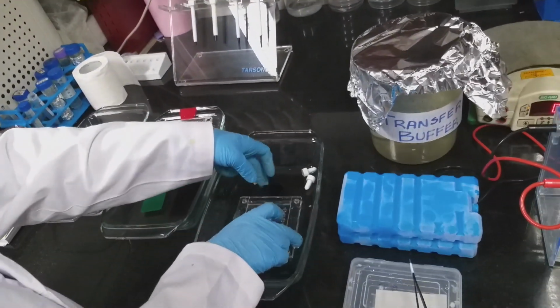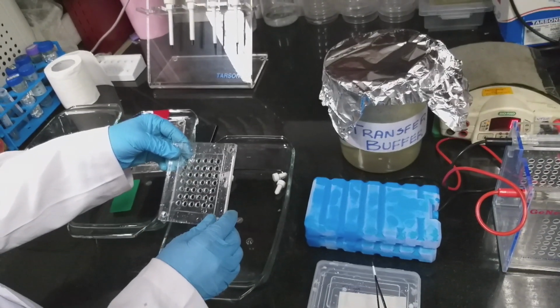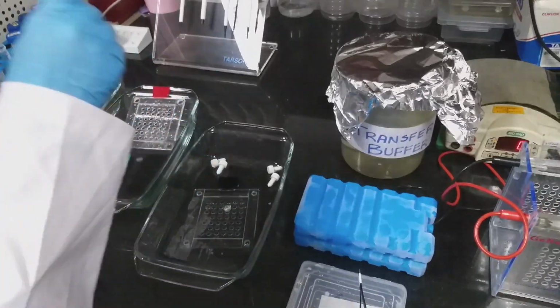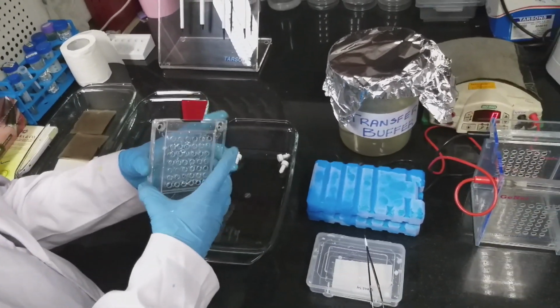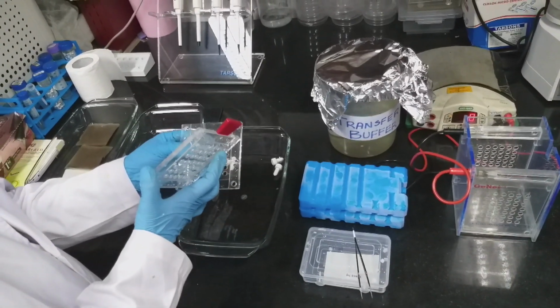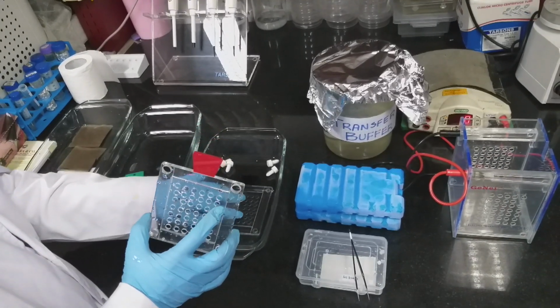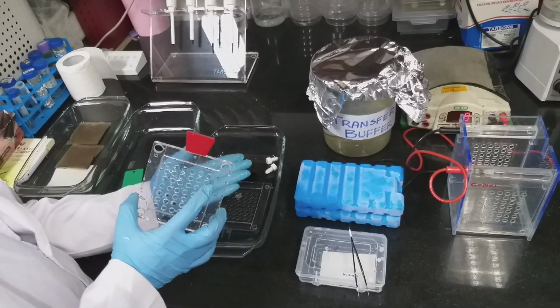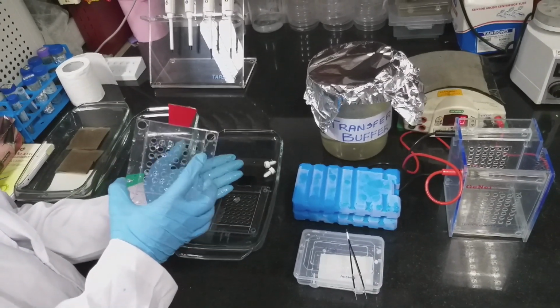This is the cassette we'll use for the transfer. This is the negative side of the cassette and this is the positive side. We are going to keep the gel on the negative side and the blot membrane on the positive side.